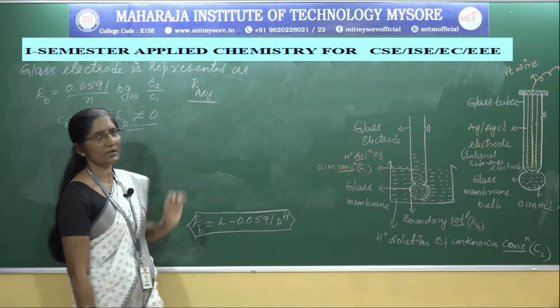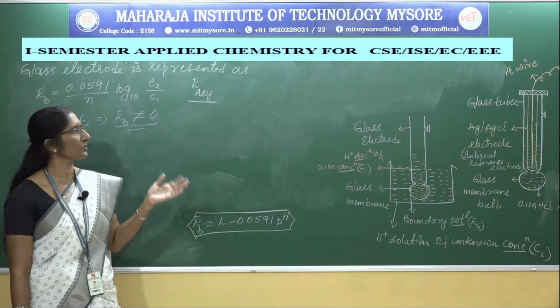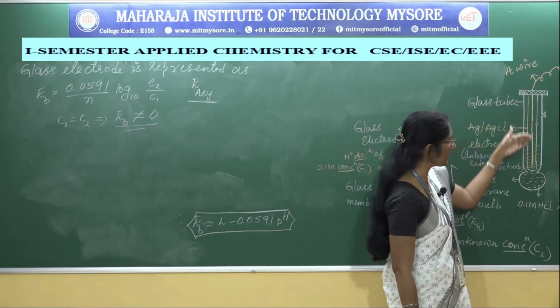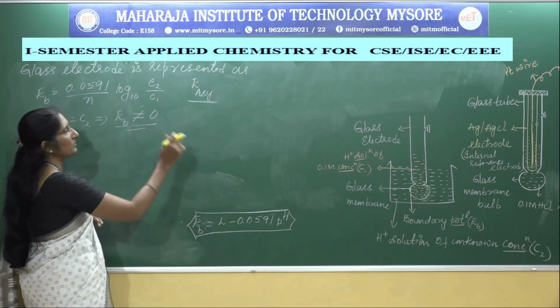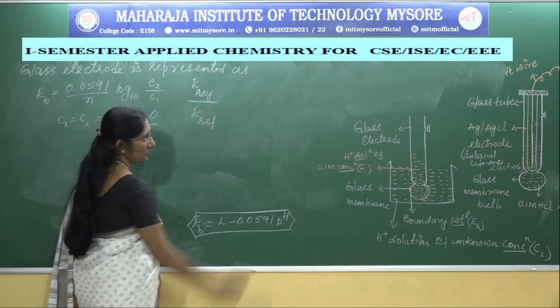This value depends upon time to time and also from electrode to electrode. Next, observe that this glass electrode consists of a reference electrode. That internal reference electrode is a silver chloride electrode. So it also develops some potential, which is considered as the reference potential.